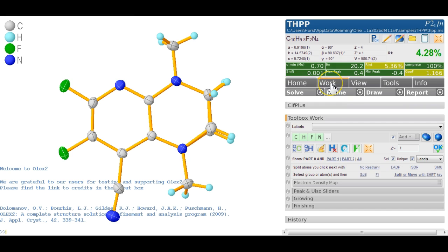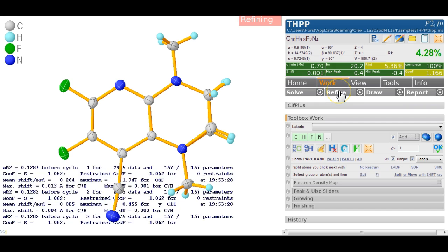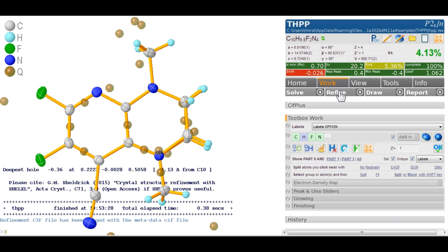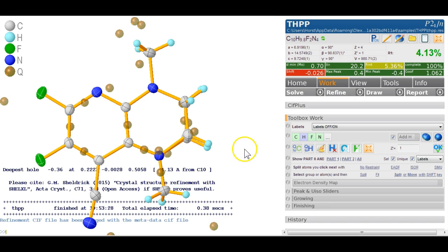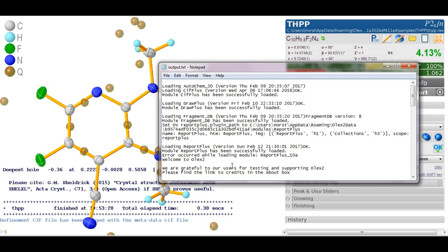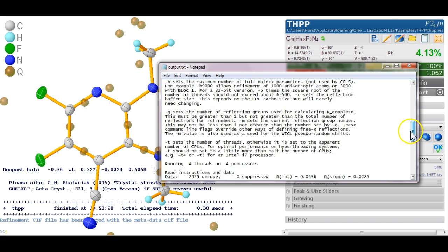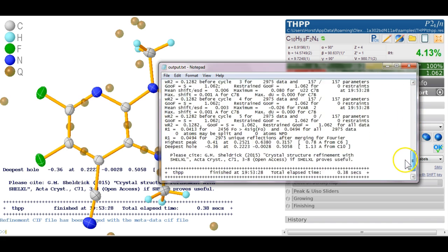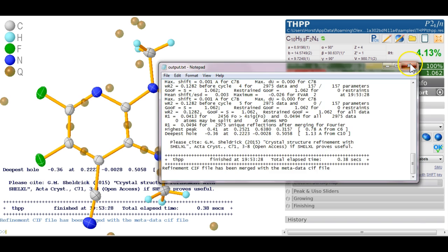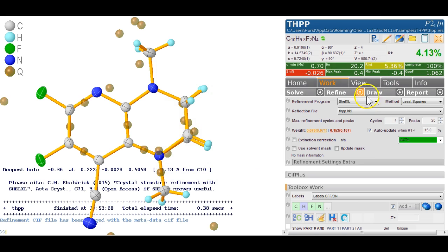Okay, in Olex 2 you click work and refine and it refines. As you can see from the output, you can type text to see the output better in the window. So you see this was a standard ShellX refinement and that's exactly what we did. We set the refinement to ShellXL so that's what we got.